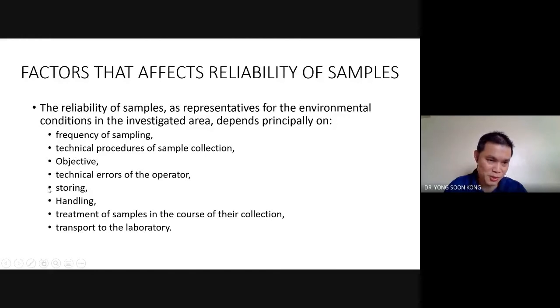Okay, moving on, storing. This may also be a factor, because the soil samples as well as the contaminants may each have a different residence time. They may sit there and stay there forever, but some of them don't. After this, I'll explain. And also the handling, how well you should handle this. Apart from the safety concern, it is also due to cross-contamination. So with handling, you have to be sure there's no cross-contamination, because that also leads to systematic error.